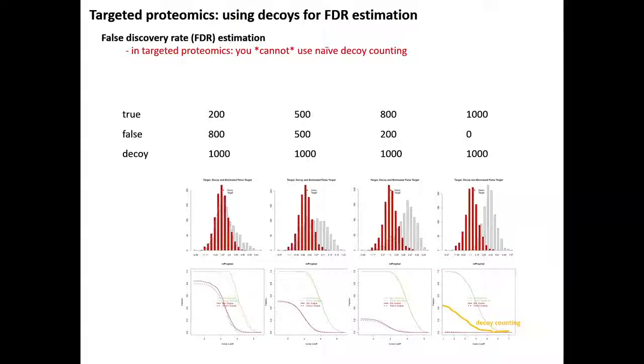I mean, this is the usual way we used to do it. It really abstracts the problem, right? It makes it very easy to rank peptides, and usually we have a problem that different tools say that the signal is better or worse, and this makes it very easy for us to compute error rates and to do statistical estimation. We can also use nonlinear classifiers for this. This can also improve the situation for some scenarios, but we really like the LDA model because it's very simple and it's applicable to many problems.